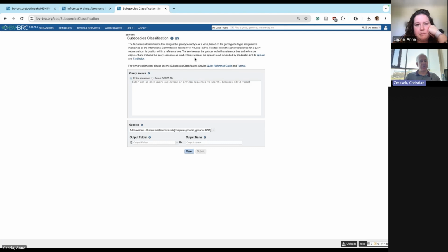And one advantage of this approach compared to BLAST searches is that if your query sequence falls out of any established clade, it will tell you that. So it's not just using the nearest clade. It will say it could not be assigned, or it's between two clades. So I think that's an advantage of this approach, and it's fast.